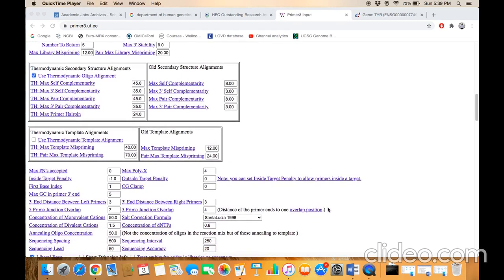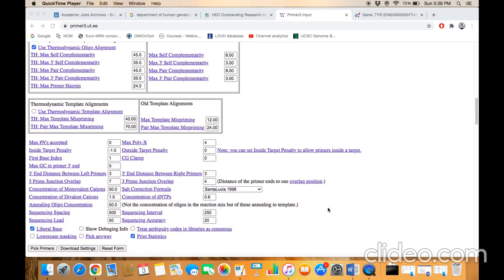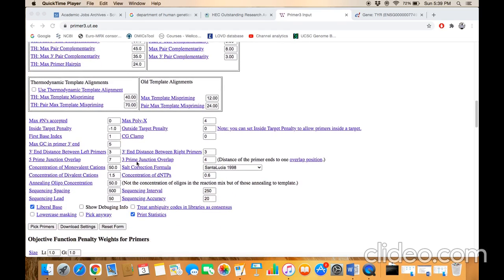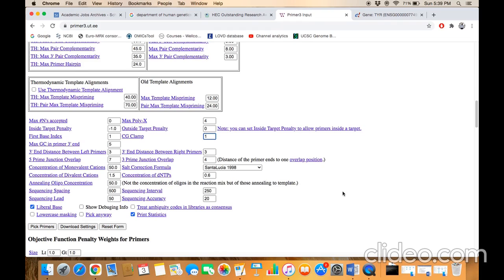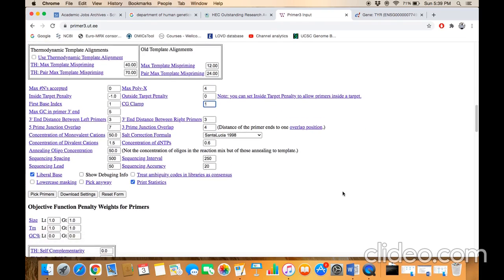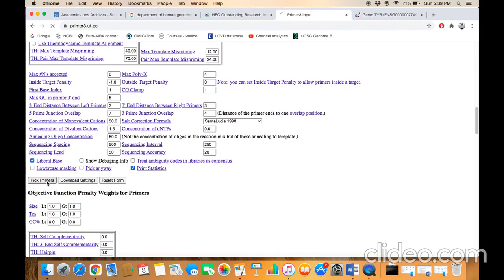that you need to set is GC clamp. Just type '1' here. One means that the software will choose a primer that should end with at least one C or G nucleotide - only one nucleotide, either C or G. If you type '2,' the software will try to find a primer which ends with either two Cs, two Gs, or one C and one G. Then just click on 'Pick Primers.'